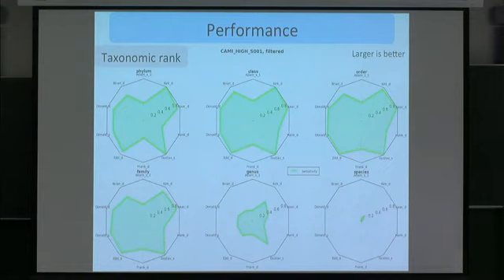Once again, changing our sample and our metric again. Now we're looking at sensitivity on the high one. And here again, you can see the area decay. So down here at species level, there's almost no sensitivity, with a tiny little bit by one of these methods right here. Whereas pretty much at the genus level is when you want to start getting suspicious. However, at the family and above level, doing pretty well. A little bit less jagged than these guys, so the amount of variability of sensitivity across methods is less.